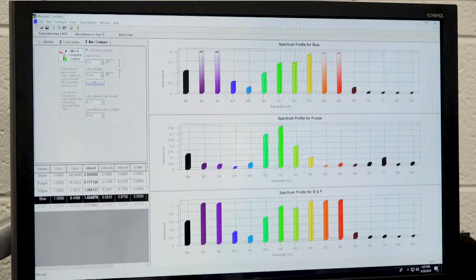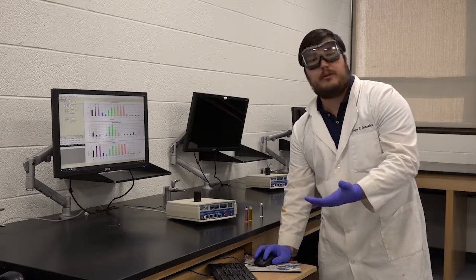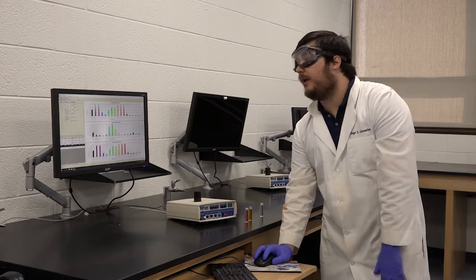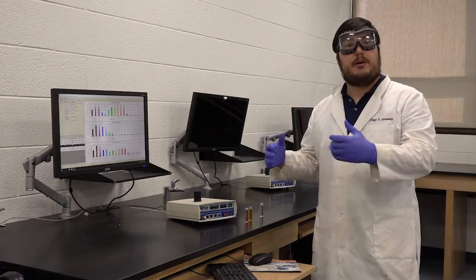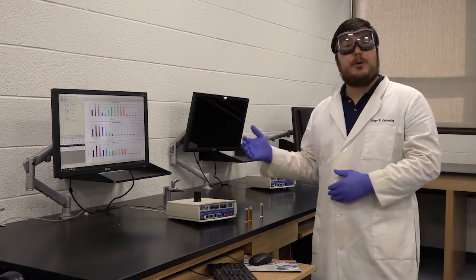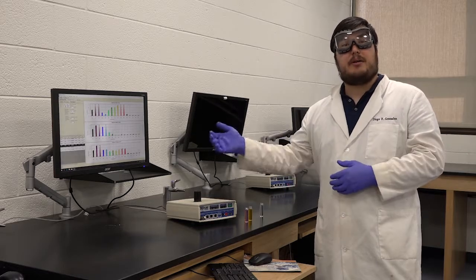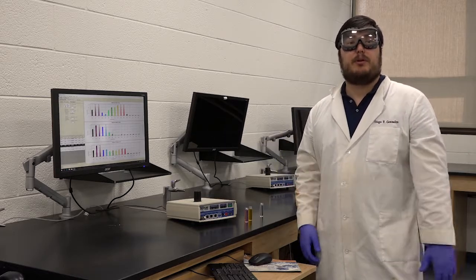You can also go to the absorbance to see what colors are being absorbed when those two colors are being mixed together. As well, you can mix the other colors together to see what different information you'll get provided for that mixing. Whenever you're done with these mixings, you're going to go ahead and go to your report sheet and you're going to copy the spectral profile for the mixings into your lab manual to provide as report data for your experiment. So go through and mix the different colors that the lab manual dictates to mix and copy or draw the spectral profile for those individual mixings.